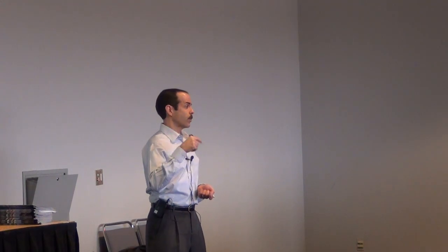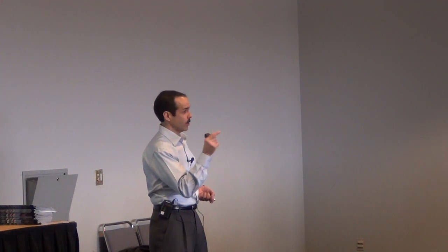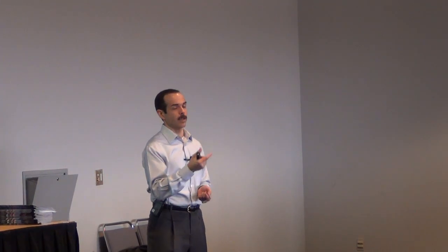Don't override that. Don't say, no, this is a 10.00. A 10 buffer is 10.06 at 20 degrees. The values change, again, depending on temperature. Let your meter automatically calibrate to the right value at that temperature. If you're not doing it automatically, make sure to look at the back of the bottle of buffer, and calibrate to the value of that buffer at that temperature. Otherwise, you're introducing quite a bit of error, again, especially with a pH of 10.